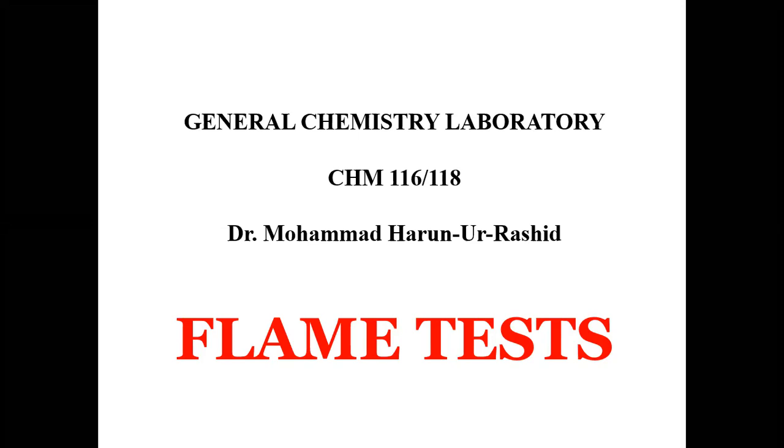Now, from the name, I think you can guess that flame. Usually, the source of flame in a chemistry laboratory is the Bunsen burner, where we use natural gas to create the flame. And we talked about there are two types of flame in our last session.